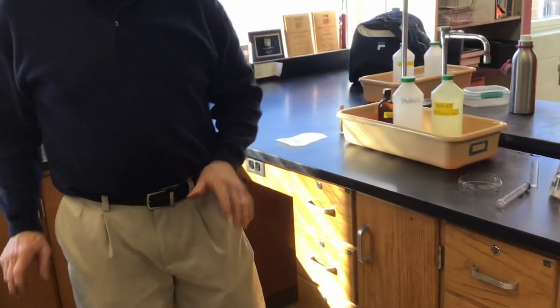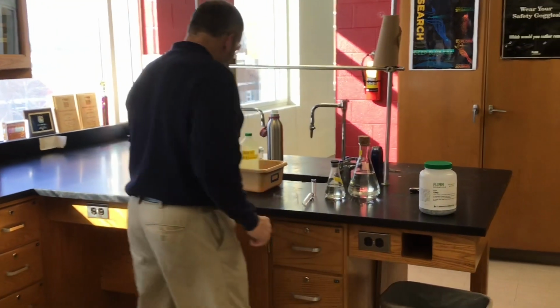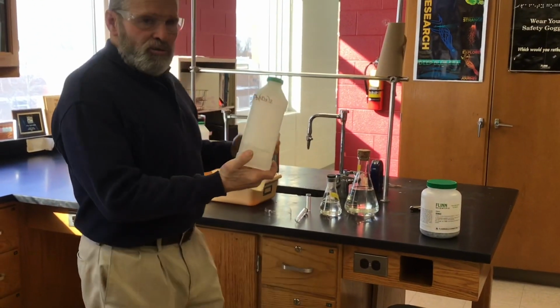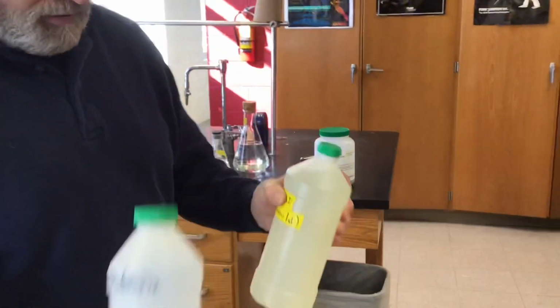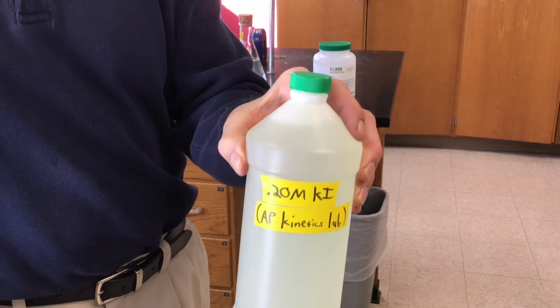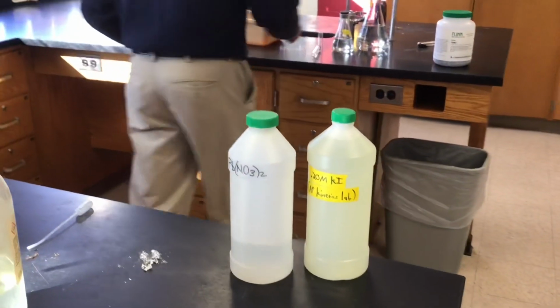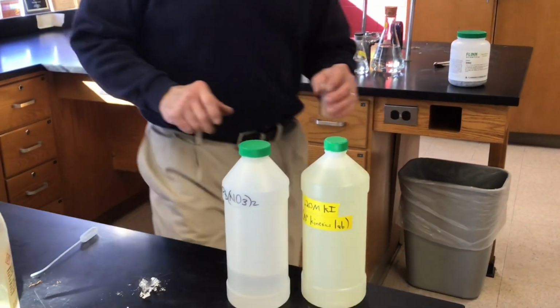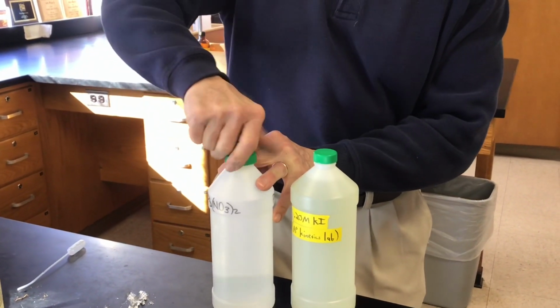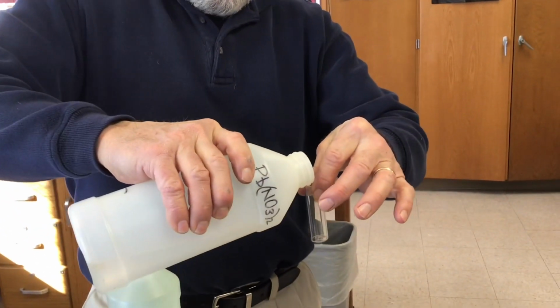All right, there's one left. Step five. This is a real fast one, too. So we're going to be mixing together two aqueous solutions. We have lead(II) nitrate, and we have potassium iodide, KI. And we're going to put these together in a little vial and see what happens. This reaction, we won't have to wait for it. It happens right away.